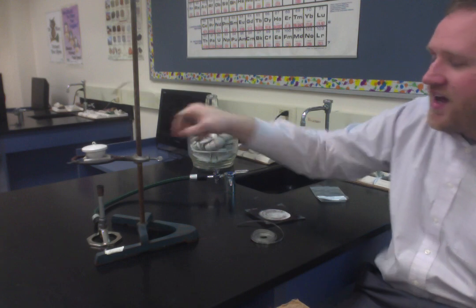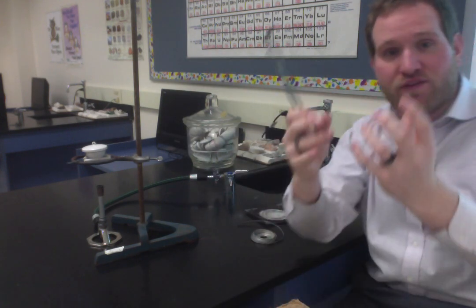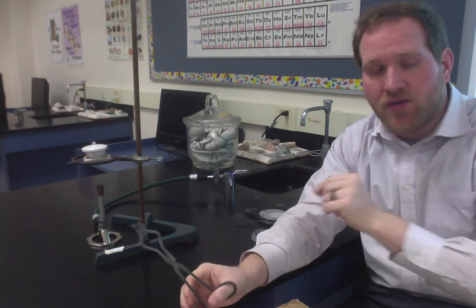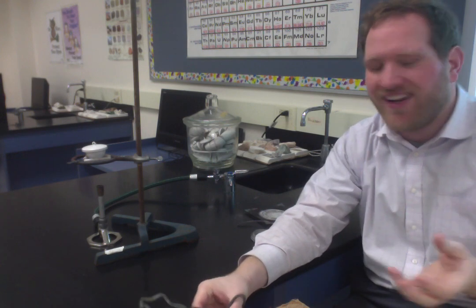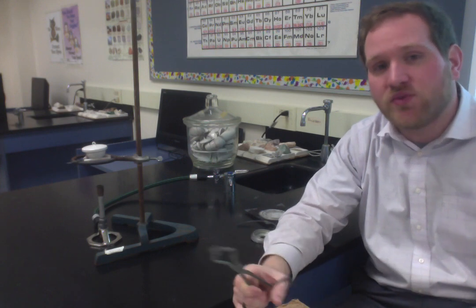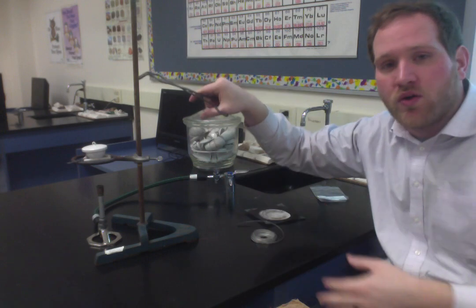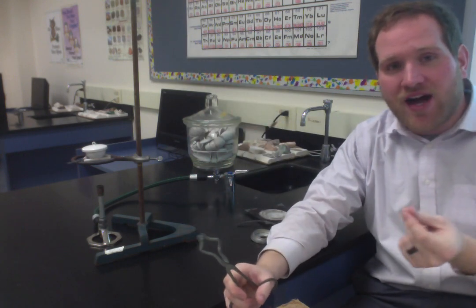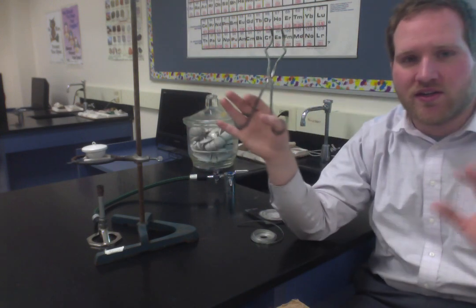And if you do that, you're going to get a big rush of oxygen, which is going to cause your magnesium to flare up and light, which we don't want. When you see the magnesium light up, what it means is it's burning very fast and in an uncontrolled way. And I don't mean like it's going to start a fire in the lab. I mean it's burning so fast it's going to bond with nitrogen. And something else will happen too. It'll start billowing this white smoke, and that white smoke is little solid particulates of magnesium oxide that are escaping into the air. And if they're escaping into the air, I mean, look, it's not harmful.